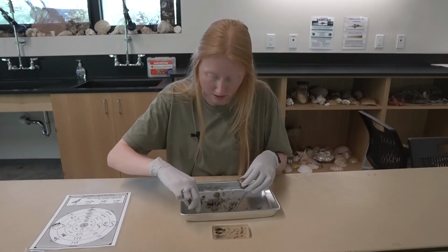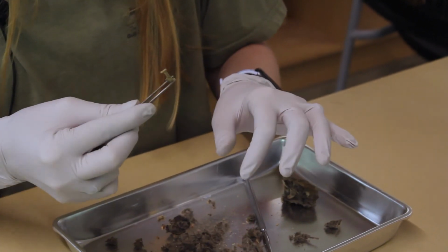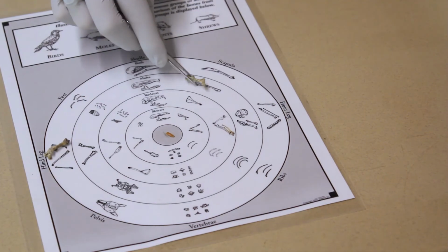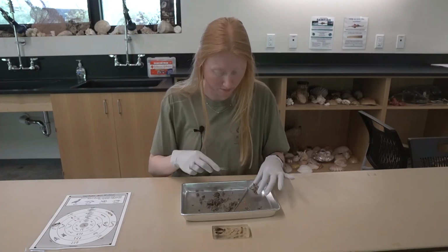Another big bone. So this actually looks like it could be some type of scapula maybe, so like shoulder blade. And it looks like it would best fit probably in this category right there.